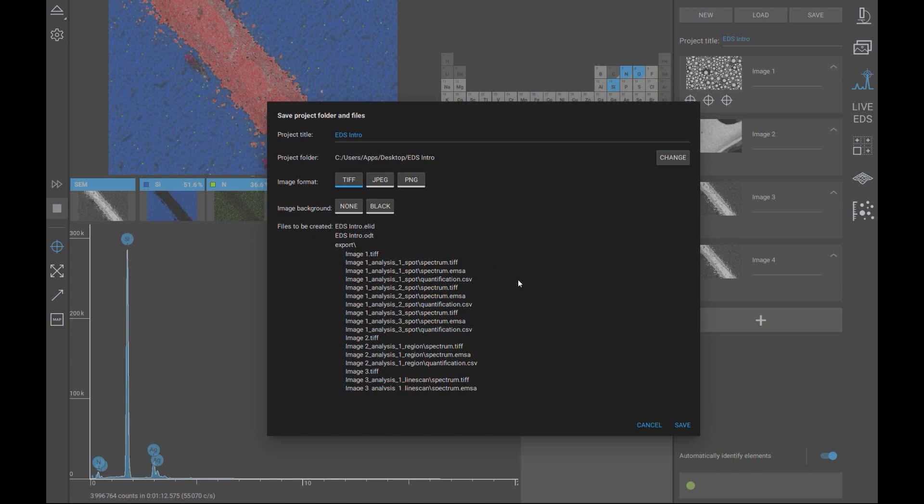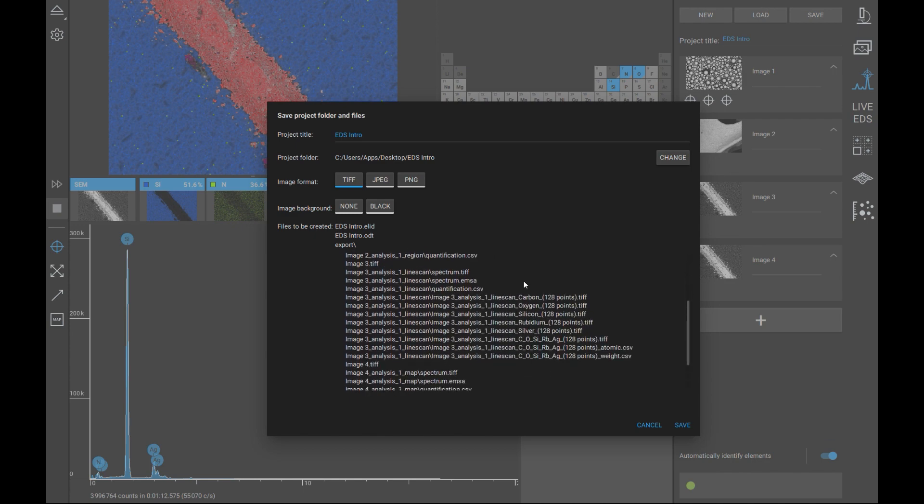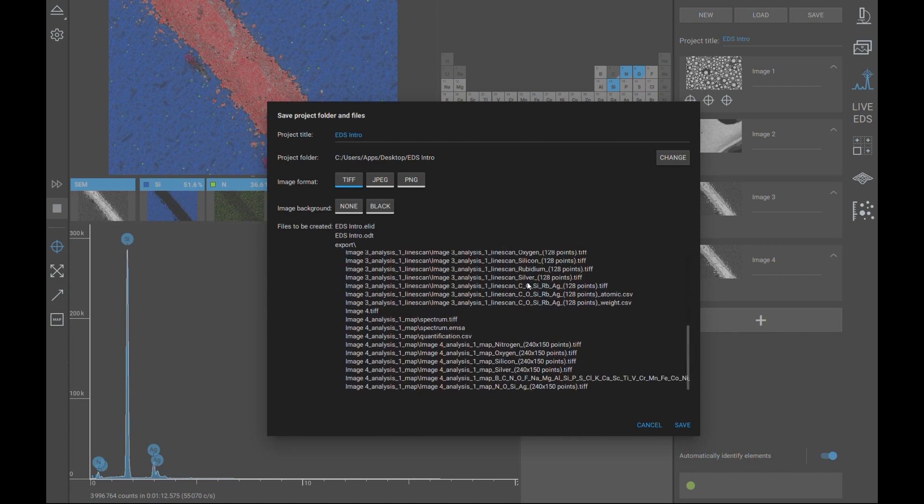Line scans will also show the area passed over by the electron beam, the combined line scan, and the individual line scans. Map analyses will show all individual elemental maps along with the measurements, quantification tables, and spectra.